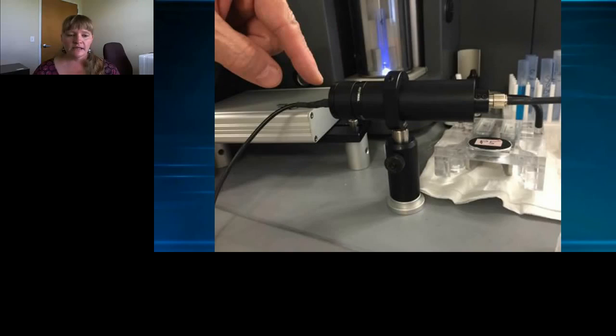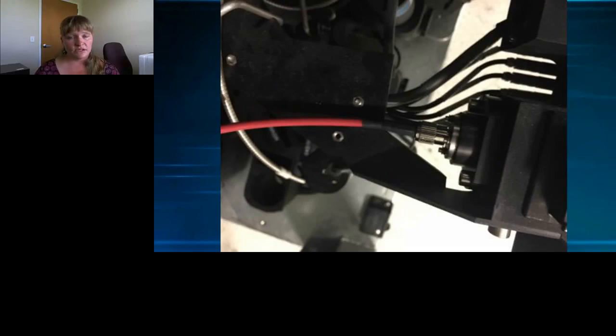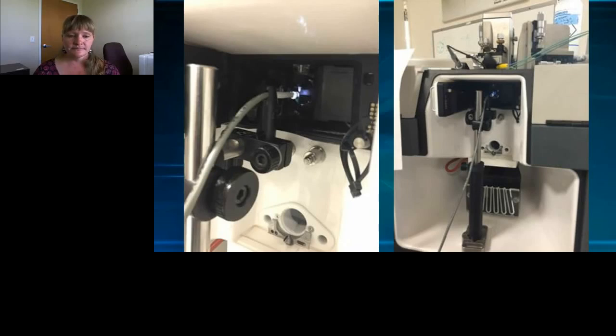We first ran the trigger LED into a fiber couple right here and into a pod, or precision optical device. This is where the collection happens on an Astrios EQ. The adjustable fluorescence pulse was then placed near the stream. Here is the interrogation of the Astrios. You can see the LED light located here next to the stream, and it's illuminating but not touching the stream.